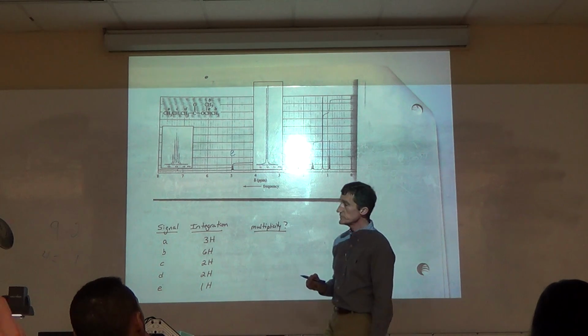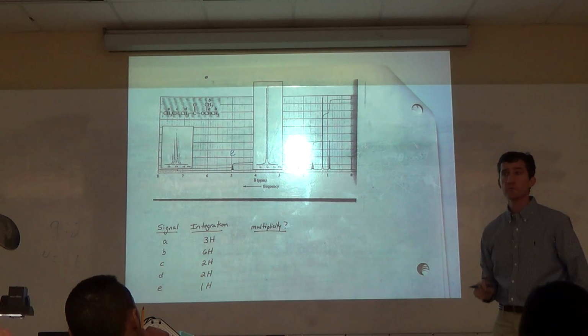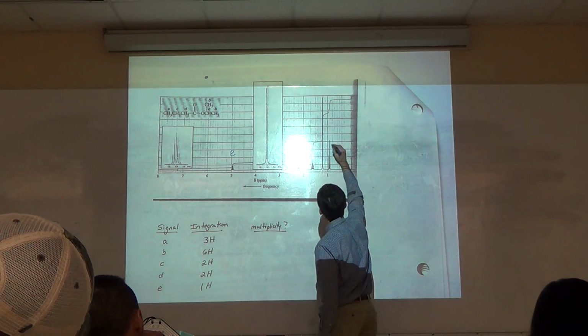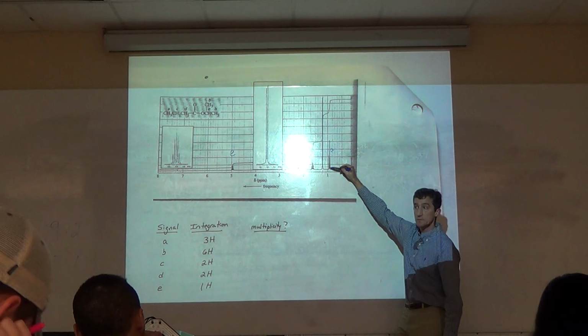Which signal would be most upfield? That's going to be the one furthest away from a de-shielding effect. A. And indeed, this is A over here. A is getting to be more just like plain alkane.